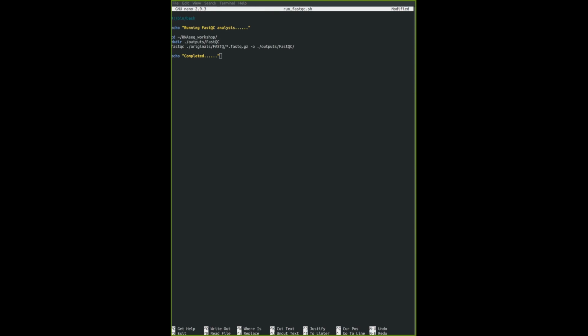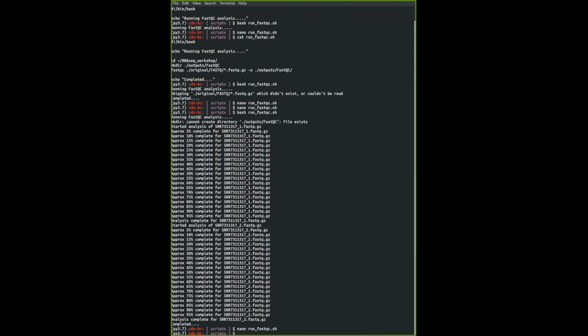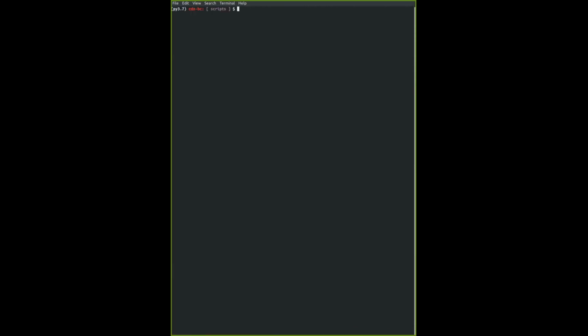Okay, cool. So we do get some sort of output from it. So Alexis, give it a try. I'll take this slow, and then we're going to go for a break in a bit, so don't worry, you won't miss out too much from here. Okay. Cool. I'm going to save and then exit. Enter, exit. Okay, cool. So we're done with the shell script.